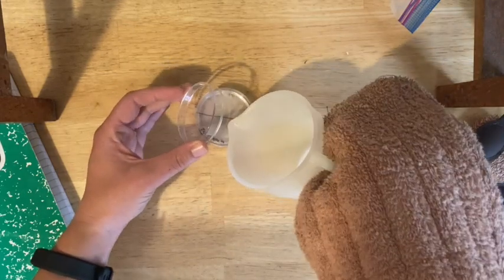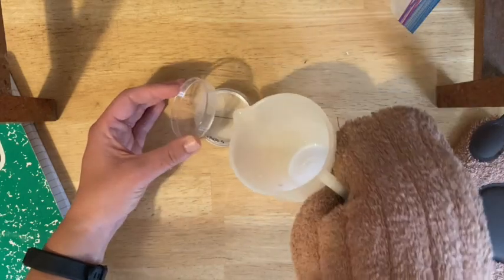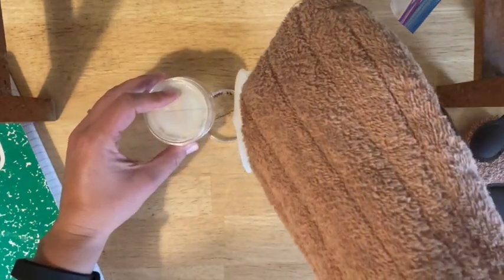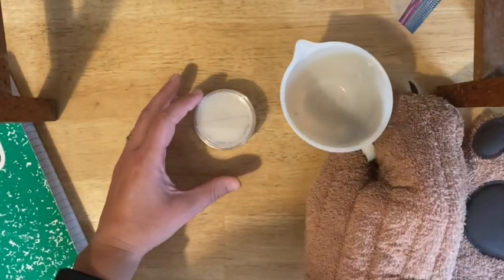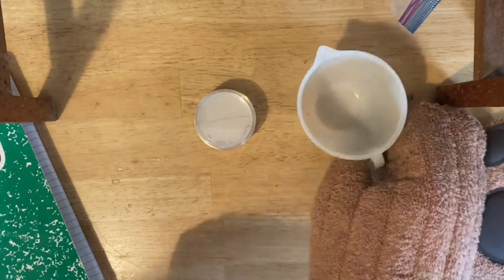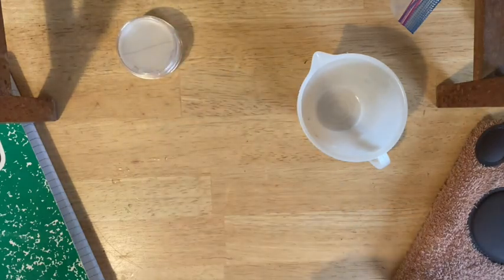Then open the top plate — don't open it too much, keep it closed as much as possible. Pour in again to cover the bottom. If you have a little extra, go back and top them up — you want them about halfway full. If you have a lot extra, you can let it re-solidify and scrape it into the trash. Set these aside and let them solidify while you prepare your yeast.